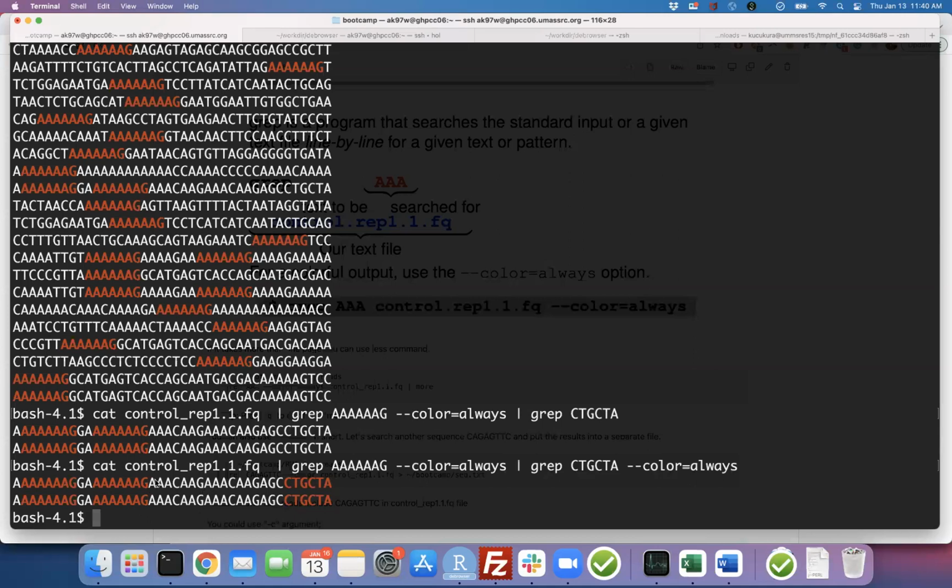that your sequencing worked. When you're designing, you do your design work like this. For example, you design one barcode with this AG, another barcode with CTG, CTA, and you put maybe 21 nucleotides in. And you want to check how many of your reads actually got that sequence in. If it is not that many, it means that it didn't work. So without a bioinformatician, you can just run this command and tell whether your experiment worked or not by checking this. And you can run this on your laptop too.